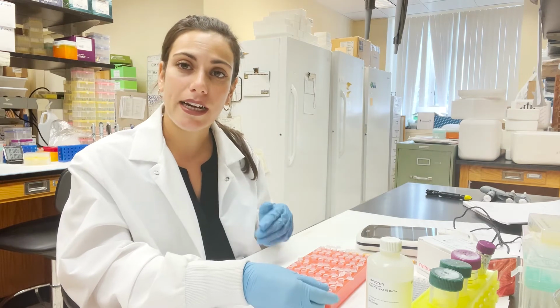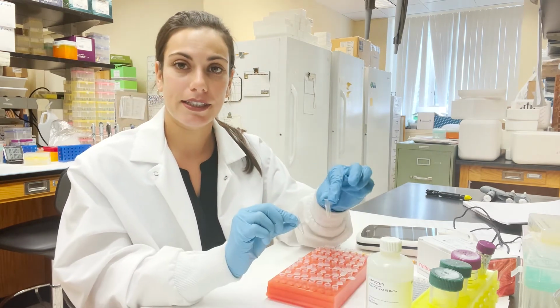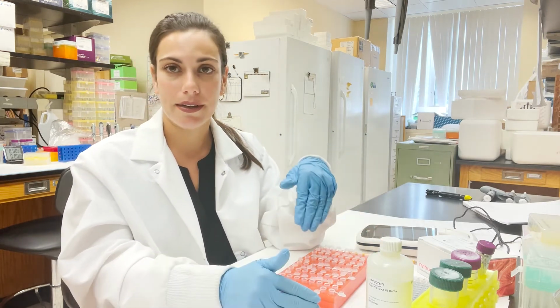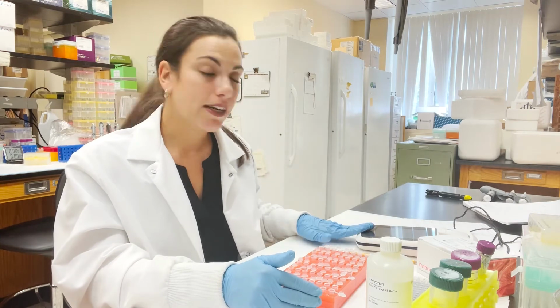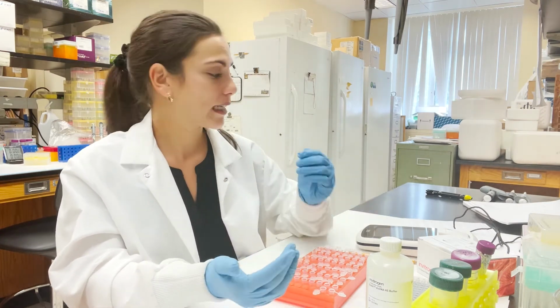But before we can actually get our readings, we have to calibrate it using a standard. Now, these standards are in the refrigerator, so I'll go and grab those and put them in immediately, wait 2 minutes, get a reading, and then I can start going through the pipeline, and hopefully it's successful.